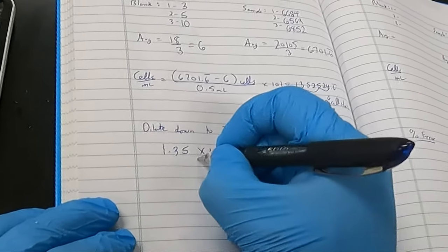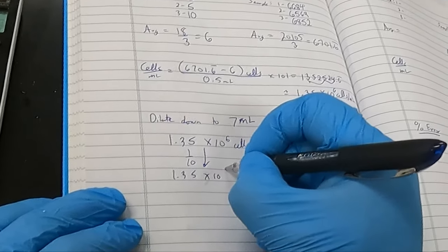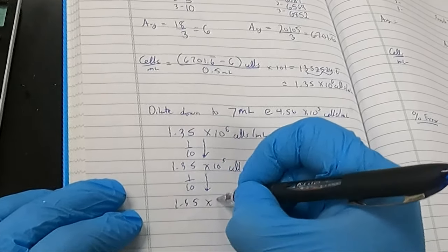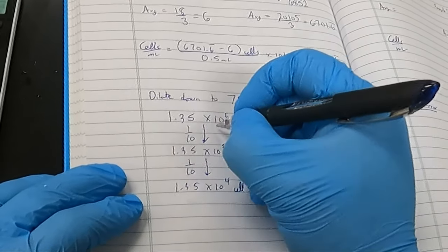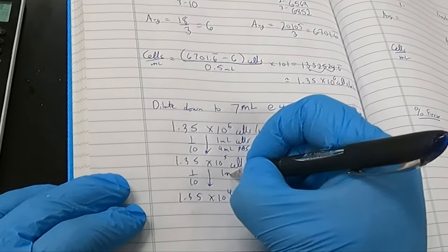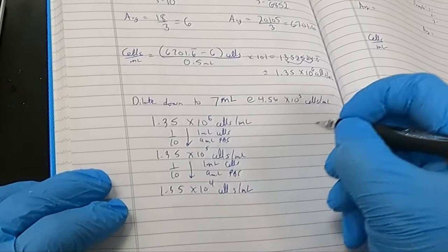To do this, I will do a number of 1 in 10 dilutions until I get in the vicinity of where I want it to be. So this brings us down to 10 to the 5. We do another 1 in 10, 1.35 times 10 to the 4. This is relatively close to 4.56 times 10 to the 3. My volumes would be 1 mil of cells and 9 mils of PBS. I will use PBS as my solvent.